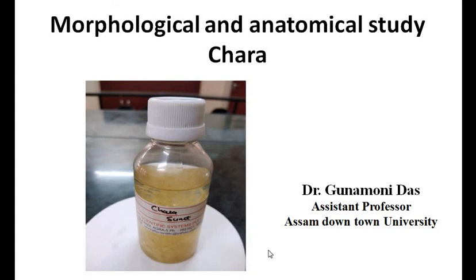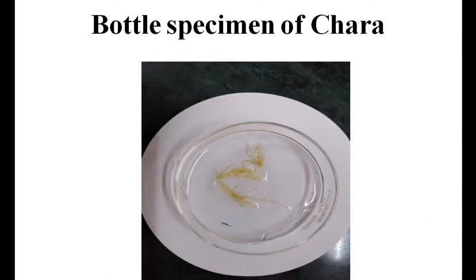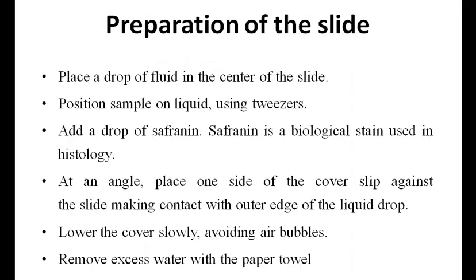Hello students, today we will learn about the morphological and anatomical characteristics of Chara. This is the bottle specimen of Chara, specimen of Chara for microscopic study. Now I will explain the preparation of a temporary slide for laboratory study.